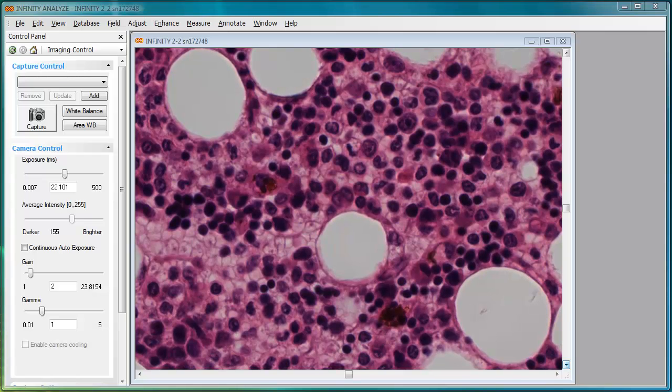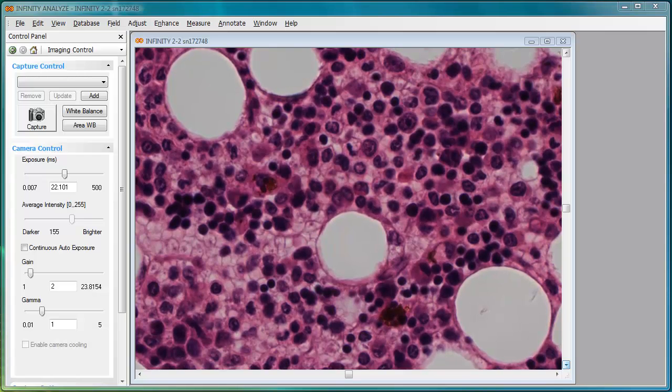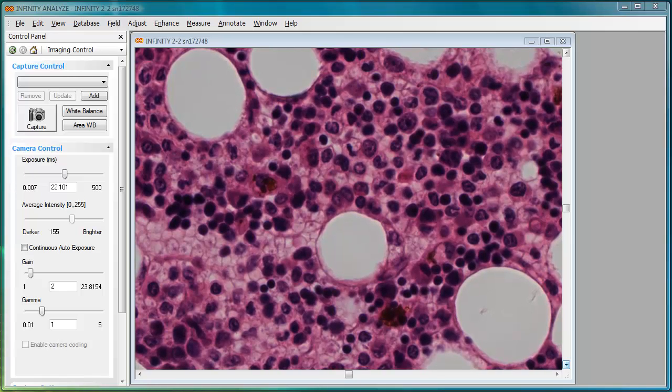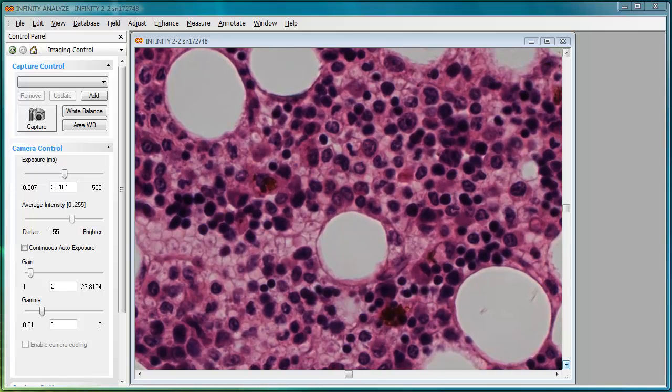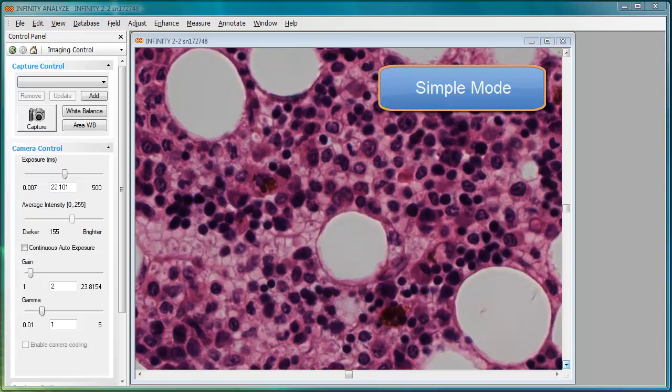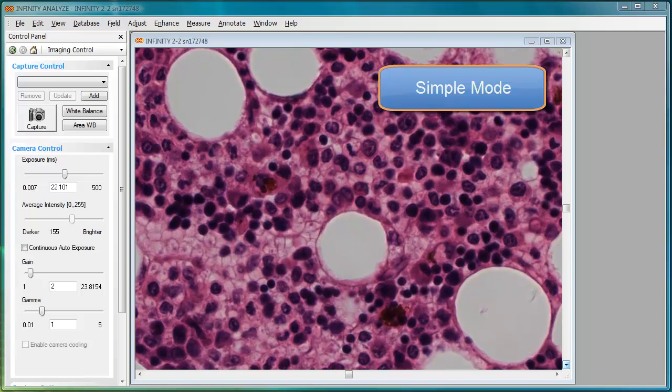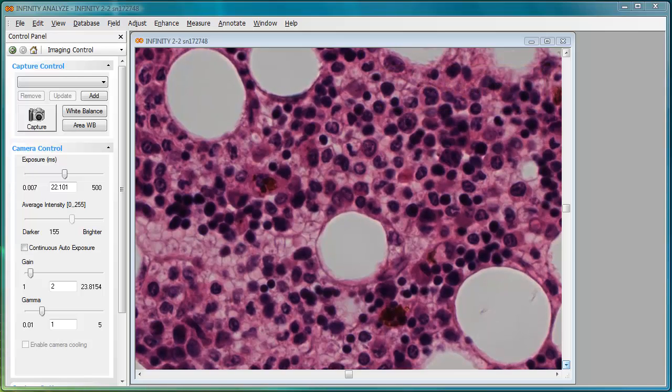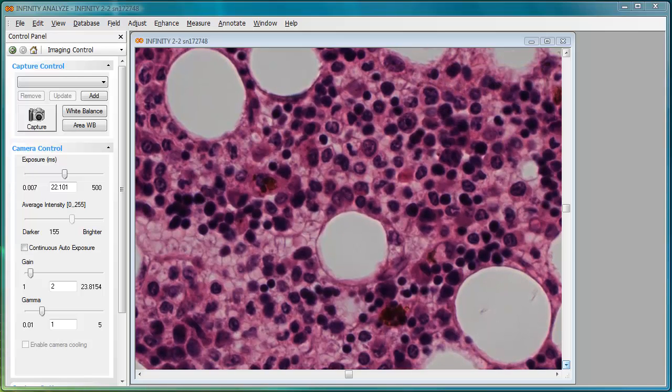When Infinity Analyze is first installed on a computer, it is configured to display in what is called simple mode. This represents the minimal set of menu items and camera controls that you need to get started, without the additional clutter involved with displaying too many options.